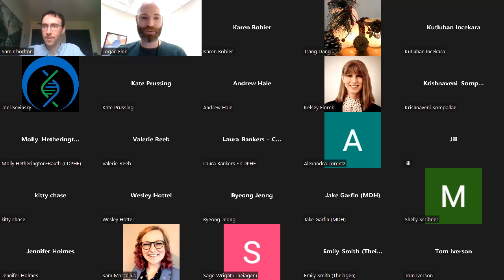All right. And so I had another question, but I think you already answered it. So the back end cloud computing that you guys are using is through AWS. Is that correct? Yeah. Okay. If users had an AWS account already, would you be able to hook it up to BugSeq somehow and utilize your own resources, or do you have pretty much your own architecture and setup? The latter. Okay. So getting your tooling working on AWS can be incredibly complex. And so unfortunately at present, we can't interface with labs' existing AWS infrastructure. That makes a lot of sense.